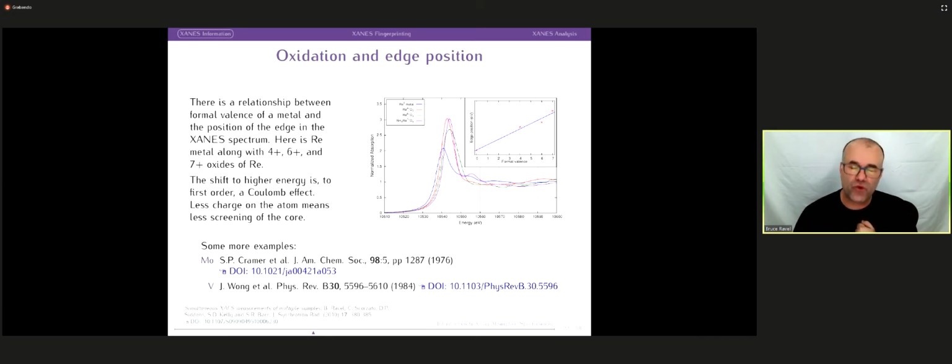That's a really great question in the sense that a very significant fraction of the experiments that come to the beamline are trying to tell exactly that. They have mixed valence systems and they need to know what the mixture is, because that mixture correlates to something about the processing conditions of the material or the environmental conditions of the sample. So great question. The next question is about XPS, or photoemission spectroscopy, versus absorption spectroscopy in terms of determining oxidation state.